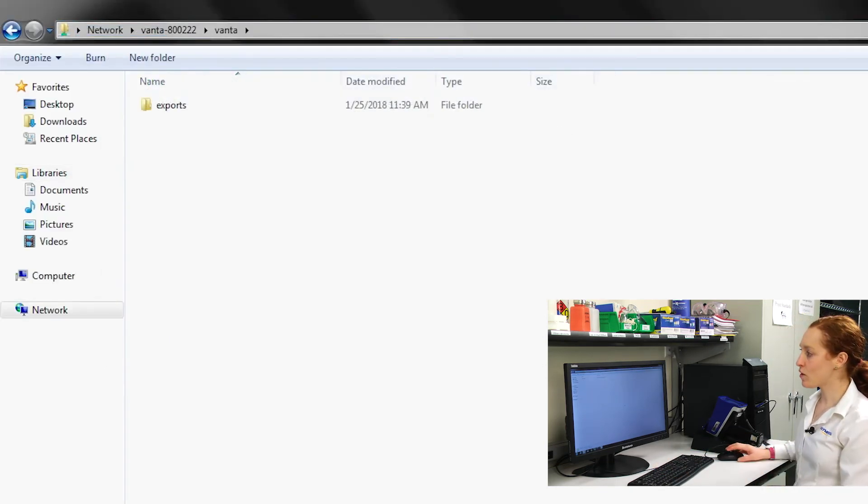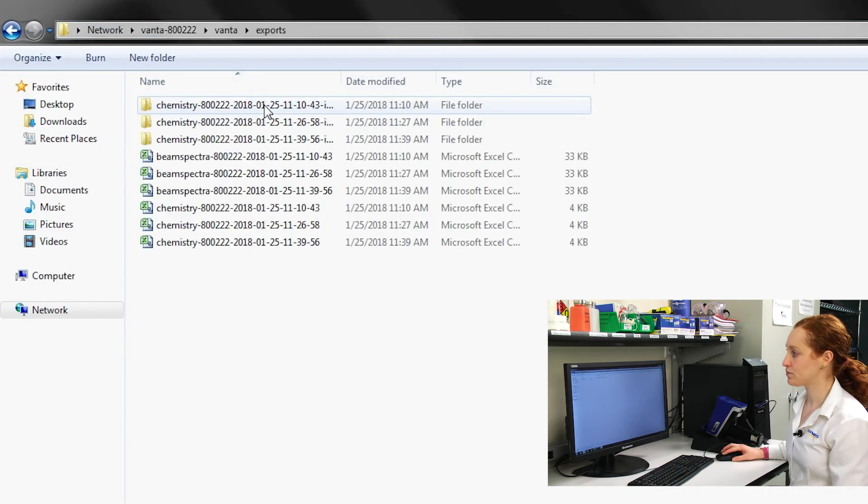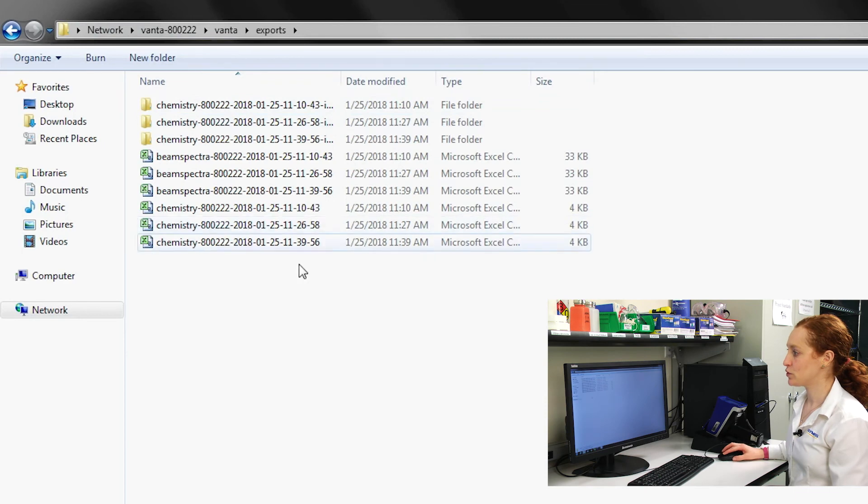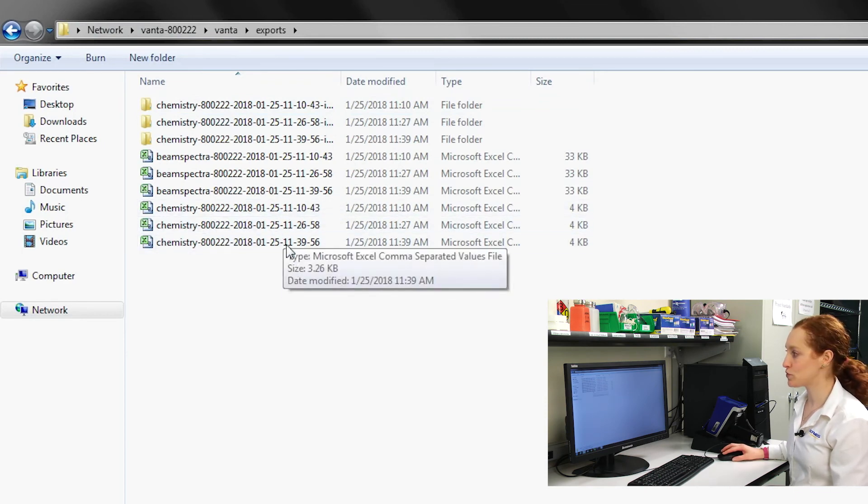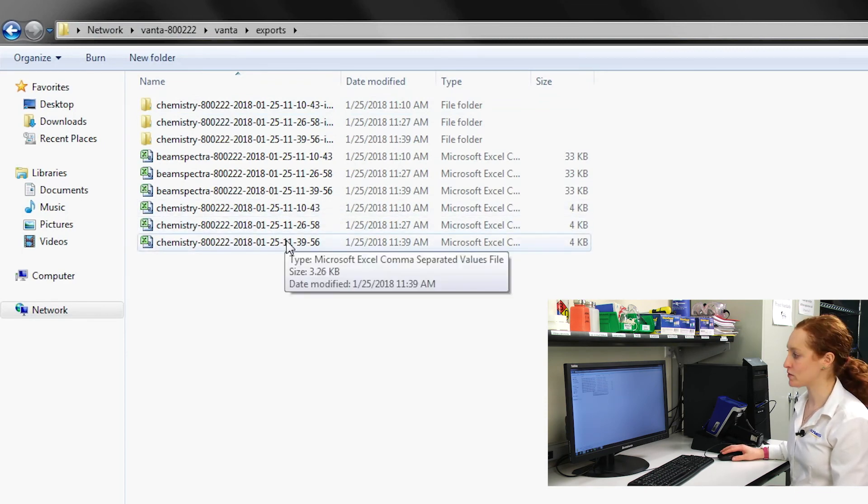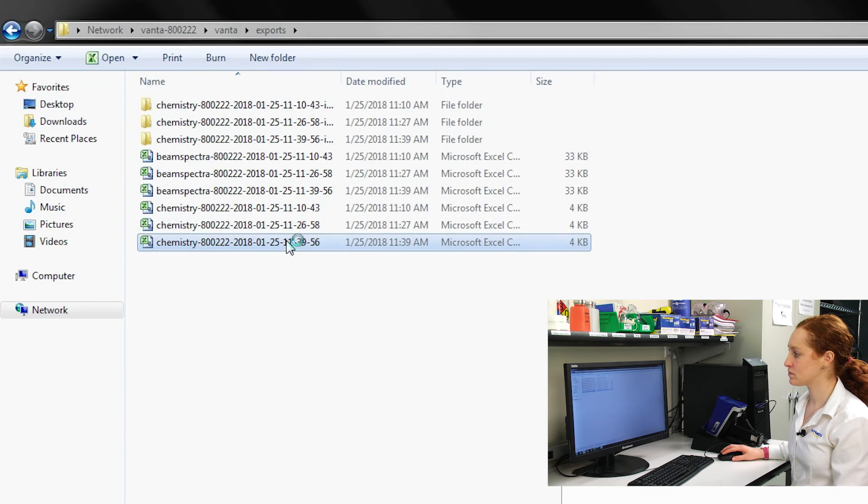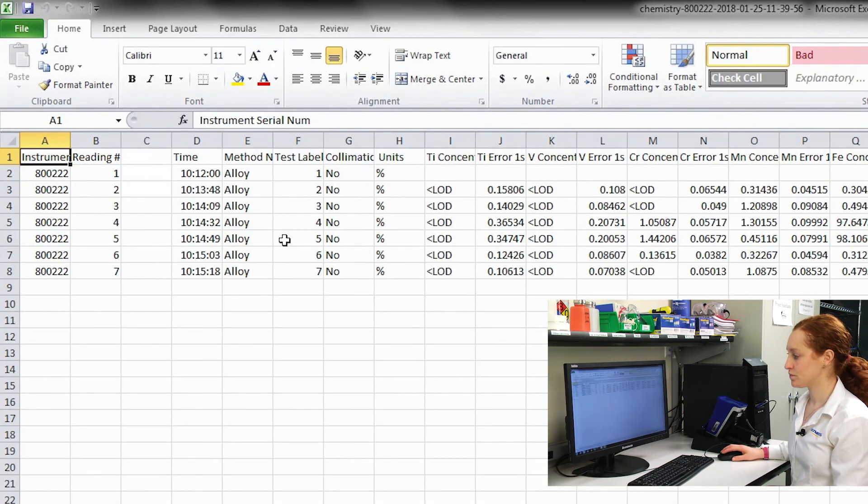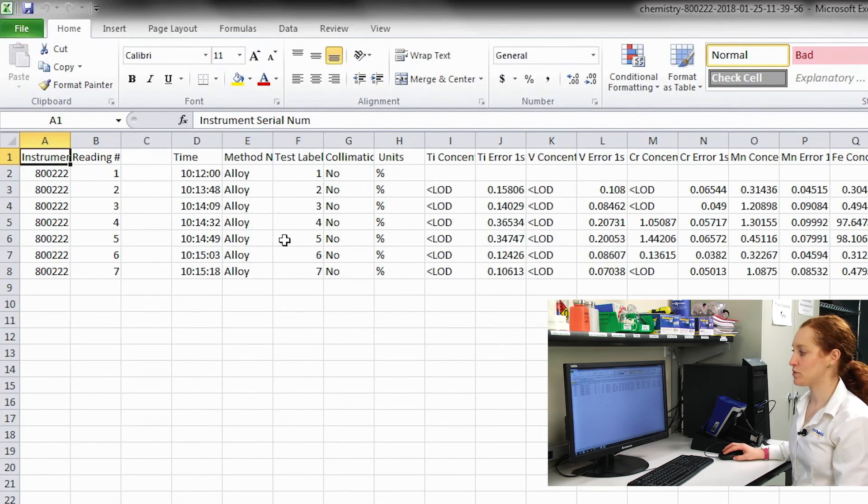Now I'll see an exports folder, which contains those same chemistry results, beam spectra, and image files. And there are my chemistry results.